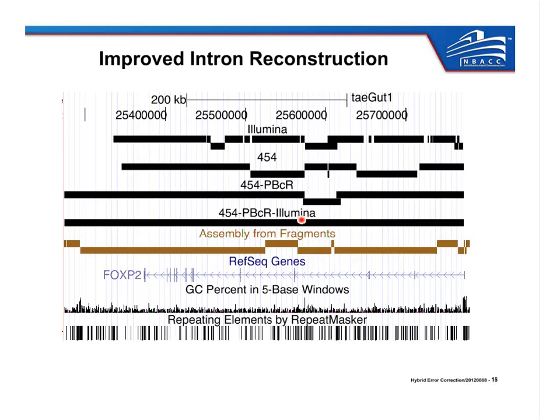And like I said, this is an extreme example, but it's a great example of the kind of benefit you get from long reads in eukaryotic genome assembly that you wouldn't get otherwise.